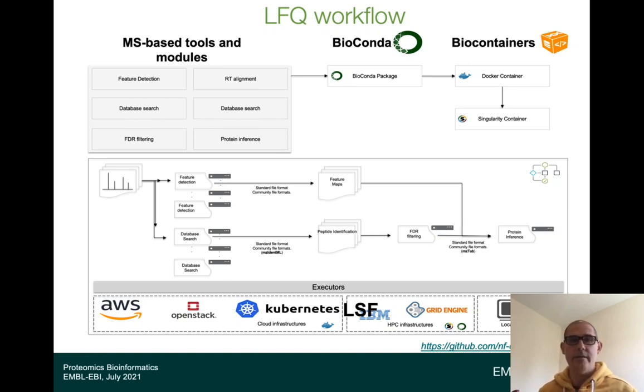There are multiple benefits. For example, if you are running your whole analysis on just one machine, well, you expect that it will take more time. That's the first thing, because if you split it into multiple tasks, those tasks can be sent to multiple machines, okay? Then you have more compute to analyze more data and finish that analysis in less time. That's the first benefit, but there are others.